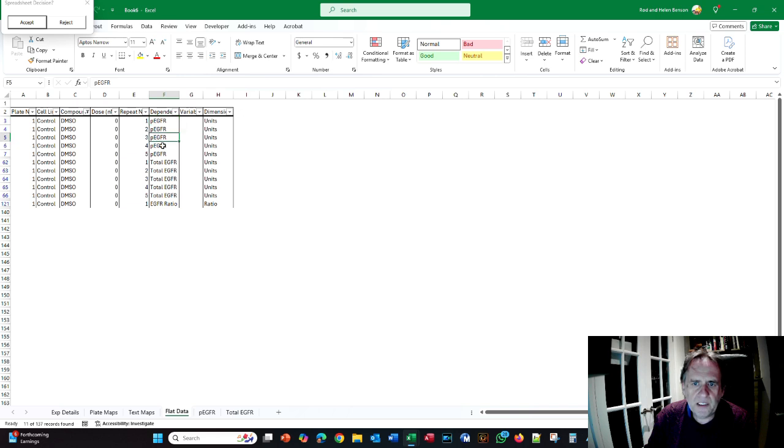In other words, sample 3 is not related to sample 3 on here. So that is the correct way to do that calculation.